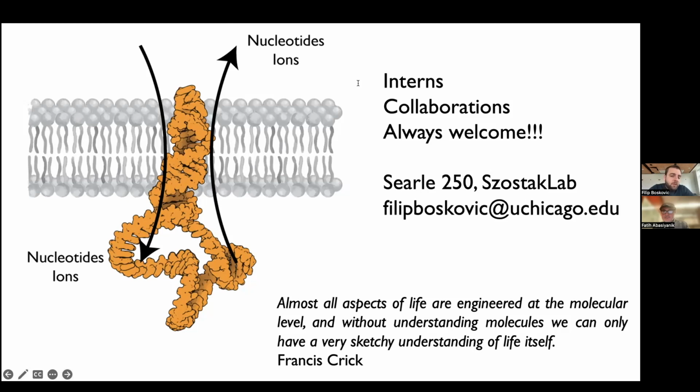Also, one reason why you can have a low activity is if you have too low a concentration of DNA, or you have an ultra high concentration of DNA, because DNA that's not labeled with the adapter sequence would just go through the pore, you know? So in that sense, it might destroy some pores. You want all of your molecules that you care about to be properly labeled with adapter, so you follow the ratios for the enzyme towards the concentration of sample.